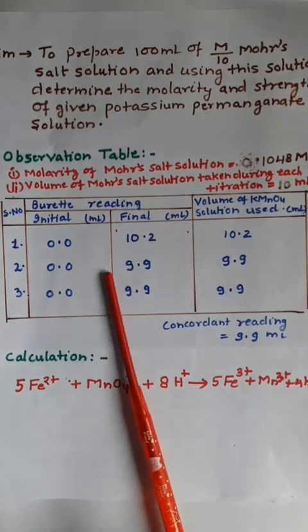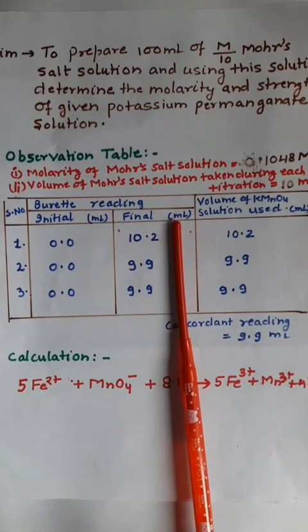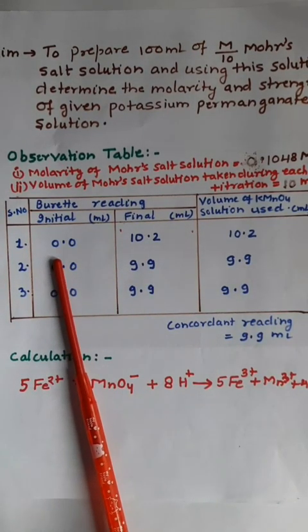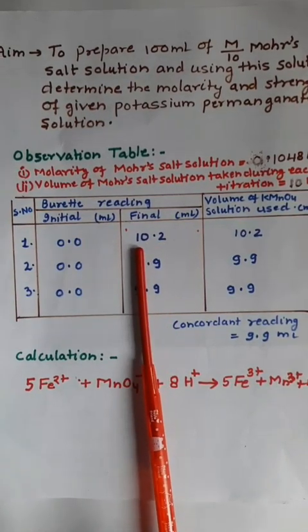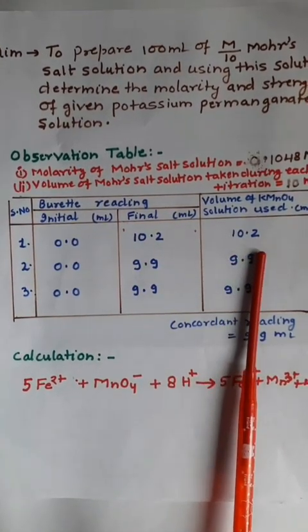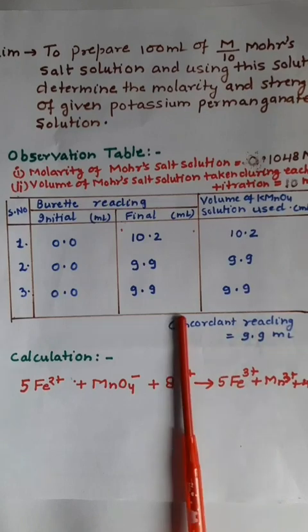In the observation table, you have to draw three columns, 1, 2 and 3, and here is the serial number. The heading of the first column is the burette reading. You have to report the initial burette reading and final burette reading in ml. Next you have to mention the volume of Mohr salt solution and the volume of KMnO4 solution used during titration. As you have seen in the video, the initial burette reading was 0.0 ml, and the final reading during the first titration was 10.2 ml. Here the volume of KMnO4 solution used is 10.2 minus 0, which is 10.2. Next, two consecutive readings which remain the same are known as concordant readings, and here the concordant reading is 9.9 ml, as you have seen in the video.